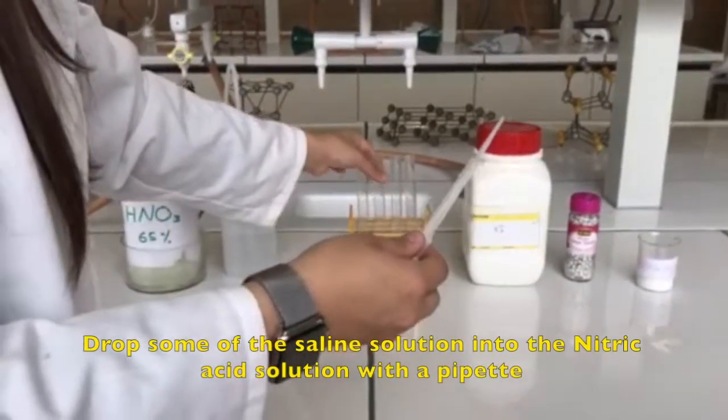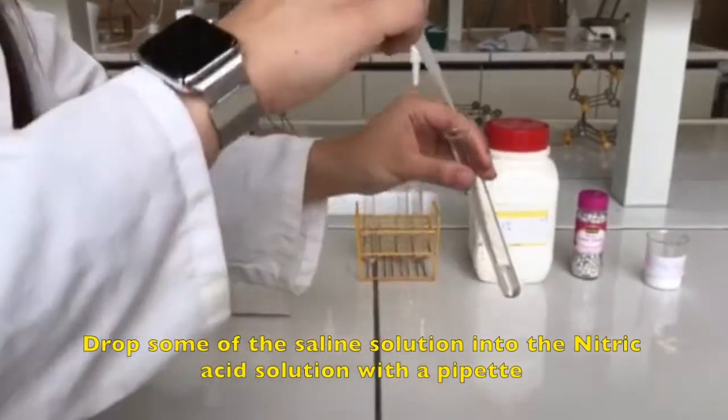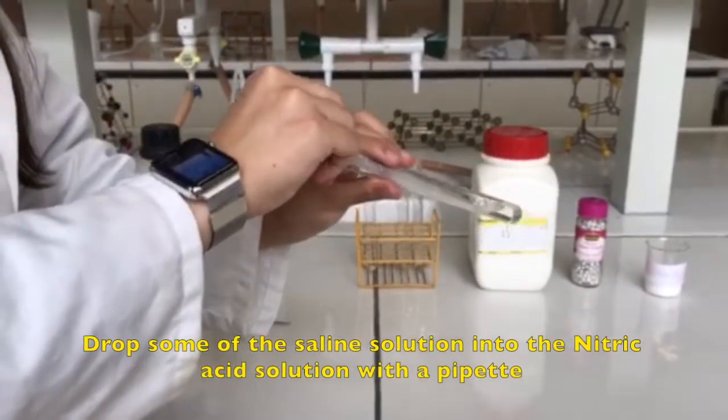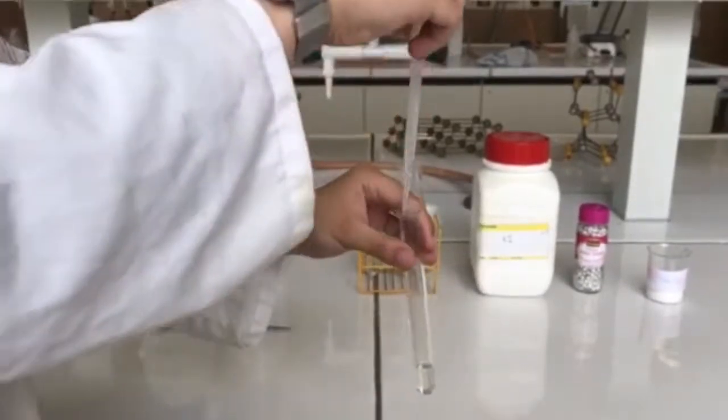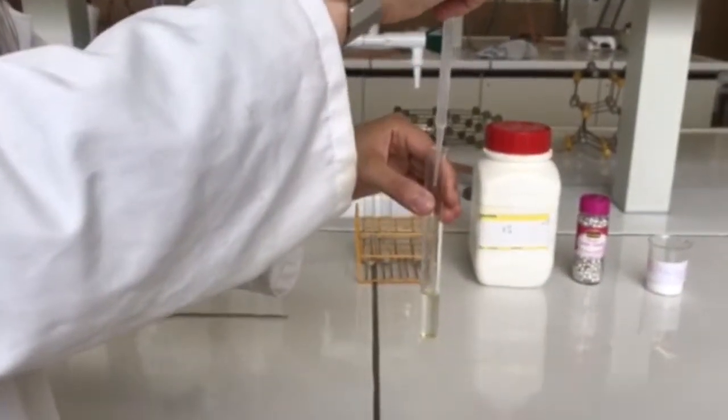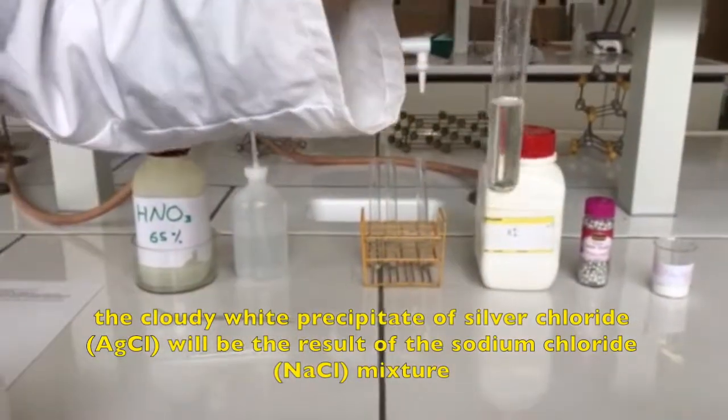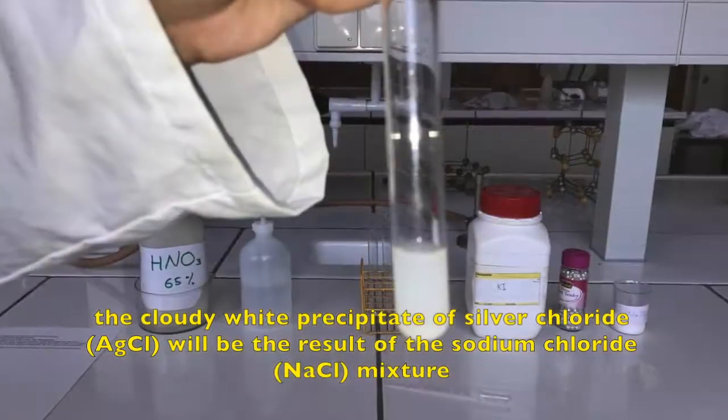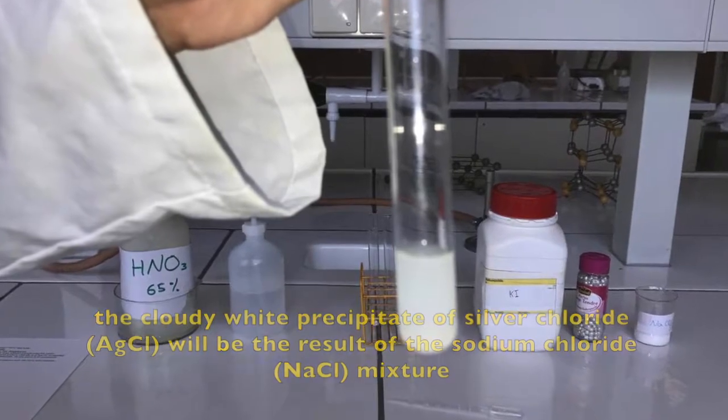Drop some of the saline solution into the nitric acid solution with a pipette. The cloudy white precipitate of silver chloride will be the result of the sodium chloride mixture.